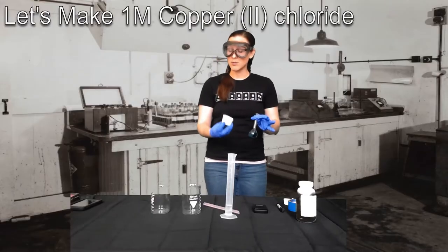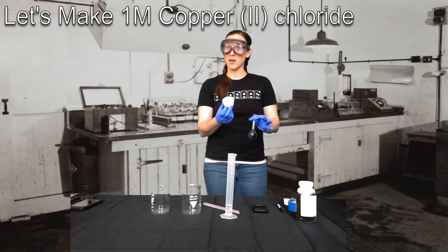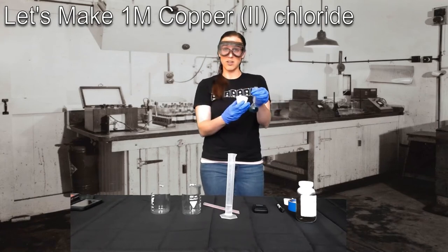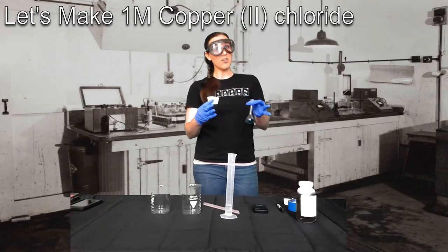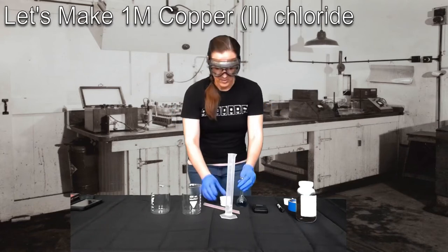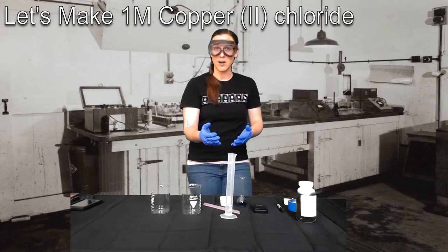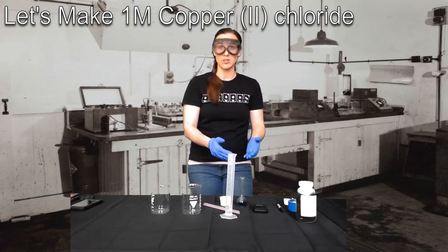Now I'm going to very carefully pour what I have in my weighboat into my 50 milliliter volumetric flask. As you could clearly see, there was still some chemical left in the bottom of this weighboat. We would like to get all of the chemical into our volumetric flask, ideally, in order to have that near perfect one molar solution. The way I'm going to do this is to rinse my weighboat with some more DI water and add that rinse to the volumetric flask.